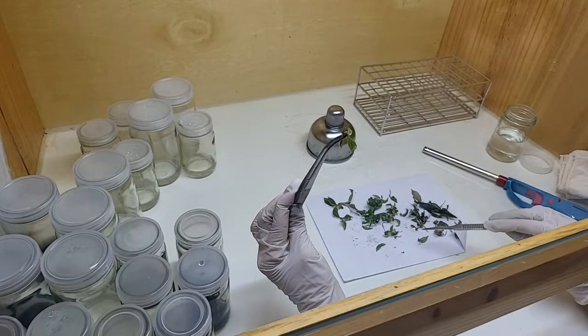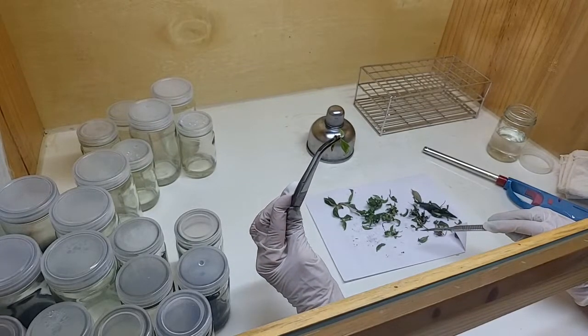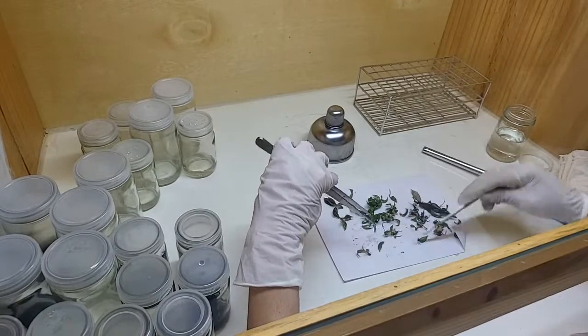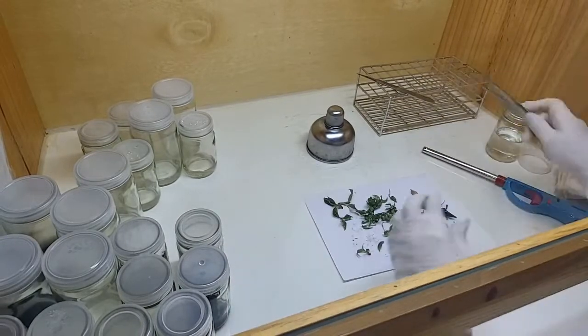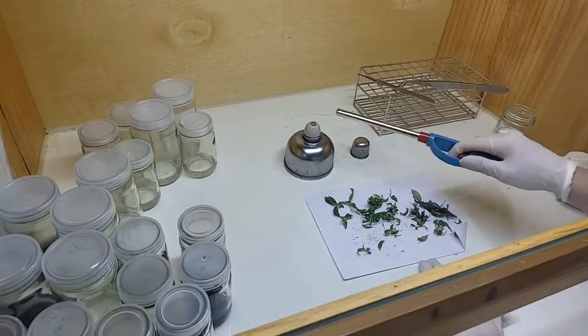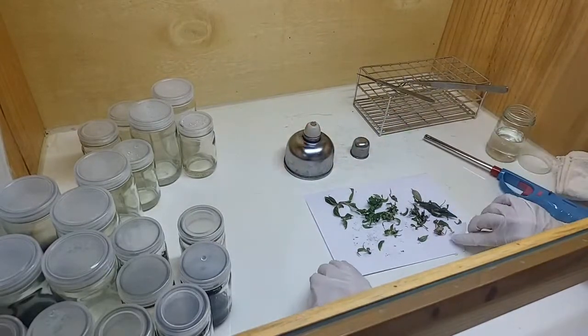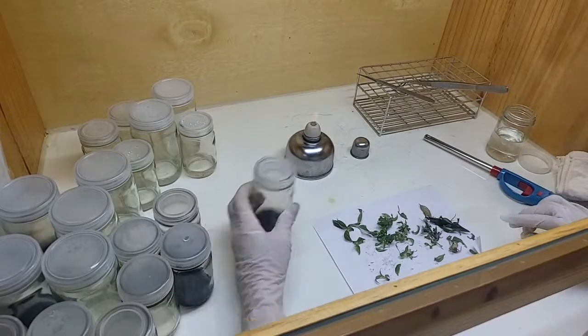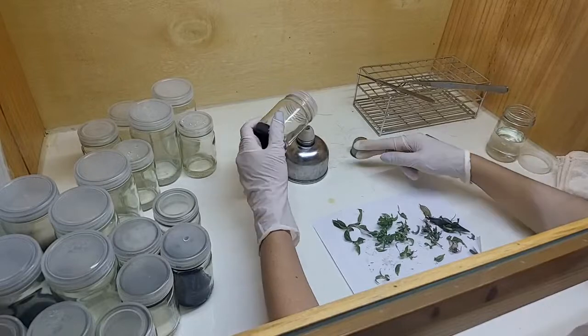Now you can see there the roots have been cut. That's what we do before putting it into a new plant — we don't need roots at this stage. We want the plant to multiply.